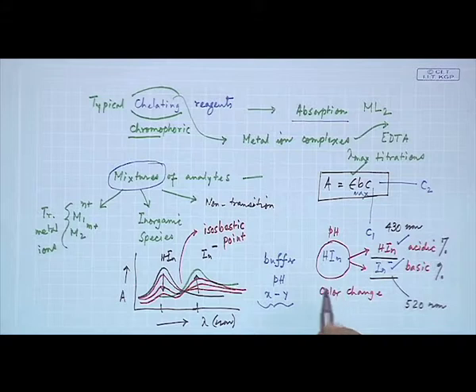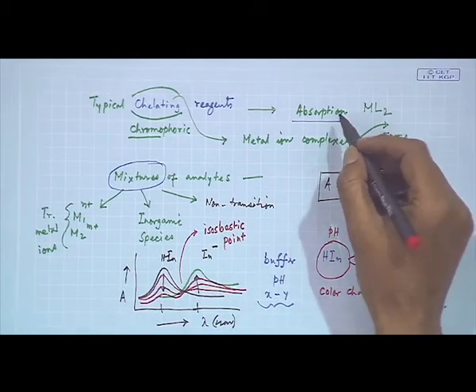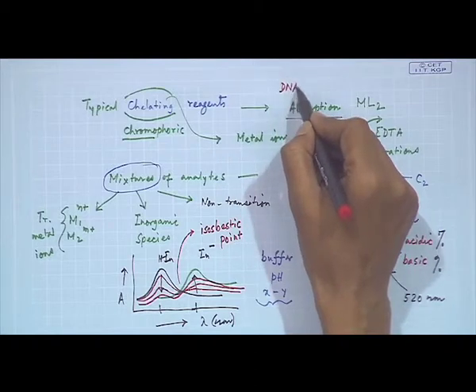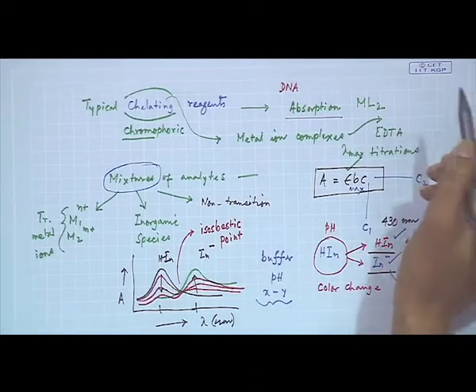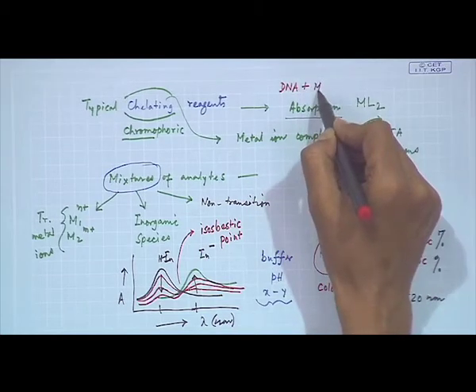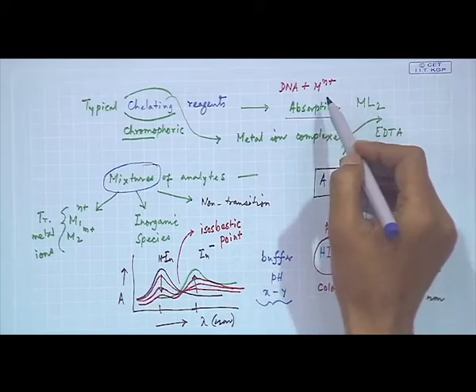which is very much characteristic for all these things and for any spectrophotometric method, because these spectrophotometric methods are also very useful for analyzing biological samples, analyzing DNA molecules also, deoxyribonucleic acids. When DNA is binding with some metal ion, say Mn plus, that can also be very nicely studied by this particular method.